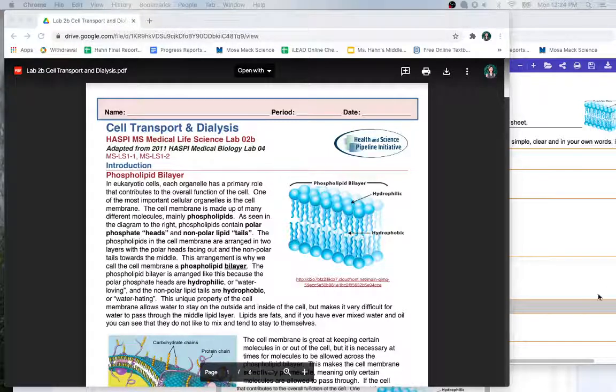Hi, I'm going to be explaining the cell transport and dialysis lab. Unfortunately, we can't do it together in class, so I'm going to be making a virtual lab for you to follow.